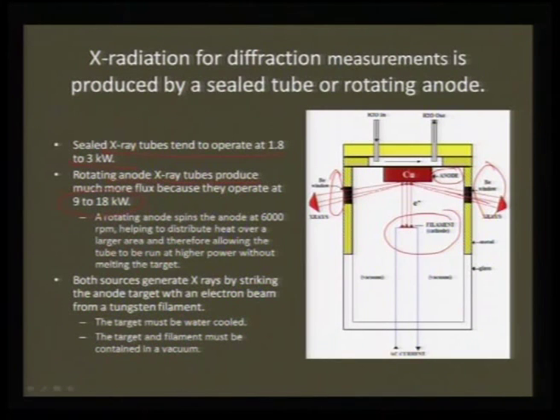Now, when you are heating it continuously, X-ray is produced. As a result, the whole of your target can melt because of continuous bombardment. As a result, at the rear side, you actually have a cooling system, and without this cooling system, your target will melt down. Therefore, you need a very good chilling unit to cool your anode, that is your source for the target. But to bring down this melting or heating effect, apart from using a cooler, you can also rotate the target so that the heat does not get localized.